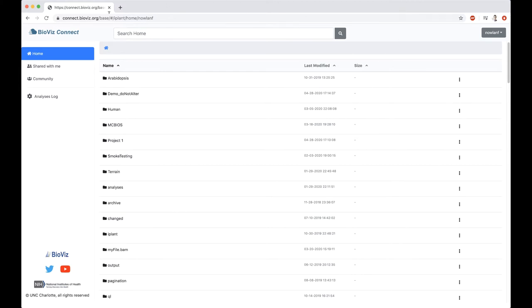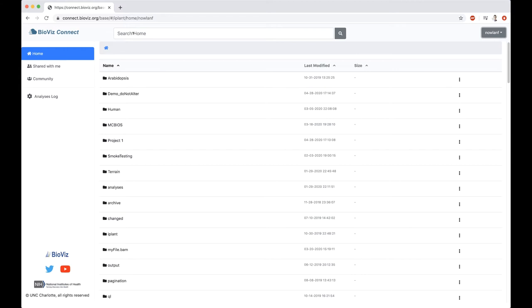Here is the BioVizConnect main page. You can see your username here, and this is also where you'd sign out. The main page is designed to be very familiar with anyone who's used cloud-based file systems, like Dropbox or Google Drive.